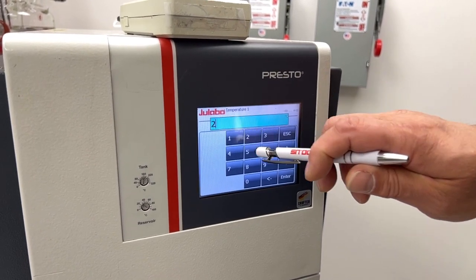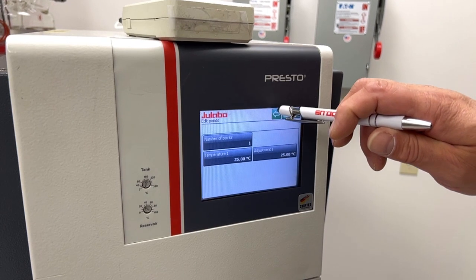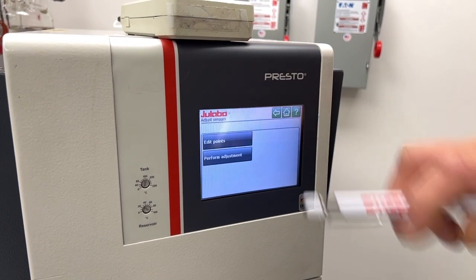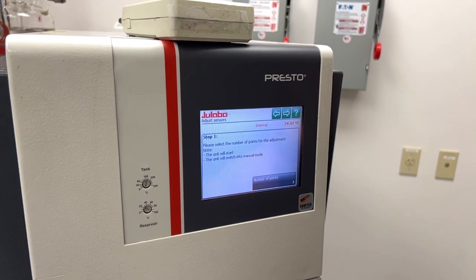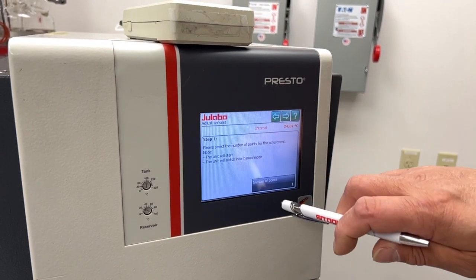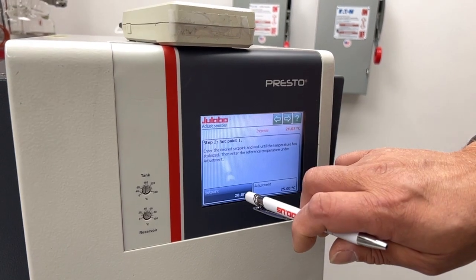Currently we have it set for 20; we can set it to 25. Then you go into Perform Adjustment — it says please select the number of points. The unit should start here.